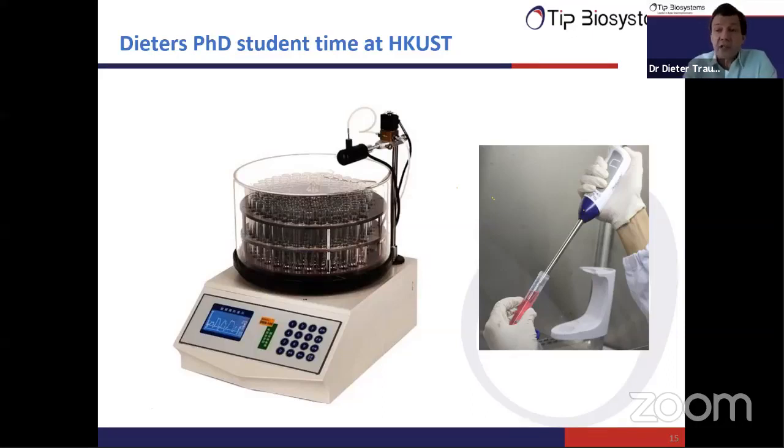And then you have many fractions, we call it fractions of a liquid, and they are fractionated in an instrument like this. You see here these glass test tubes, and there are about 100 of them. And after your chromatographic experiment, you have close to 100 tubes where your separated proteins are. But you cannot see actually proteins. They do not absorb light usually in the visible spectrum that we humans can see. And you cannot know where is your protein actually.